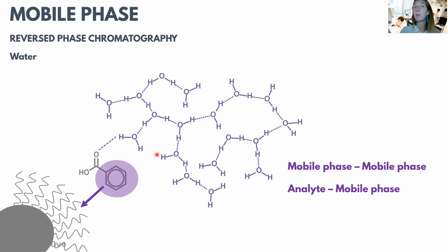One of these liquids, the mobile phase, is very polar, and the surface of the silica gel particles, the C18 groups, act as another liquid, a very non-polar liquid. So the question now is whether the compound is polar enough to actually go to the mobile phase, or is completely pushed to the stationary phase.